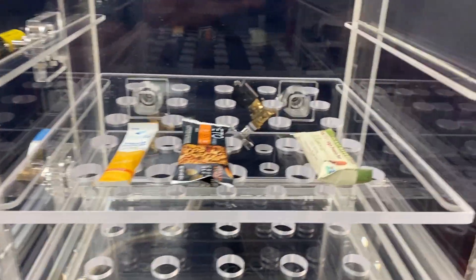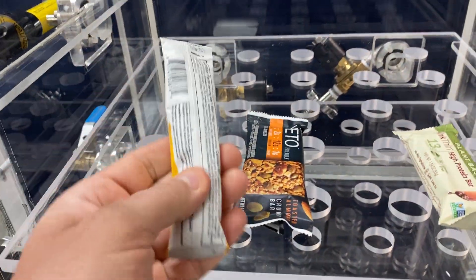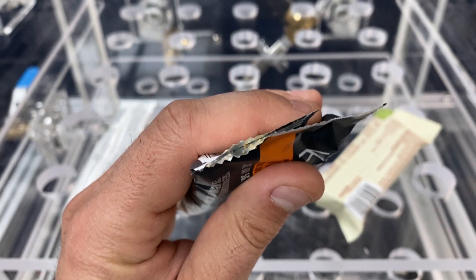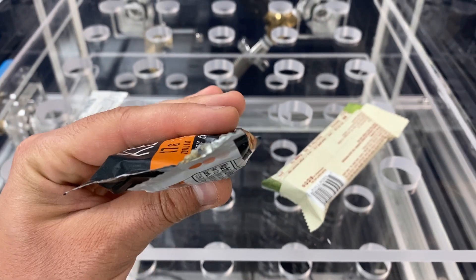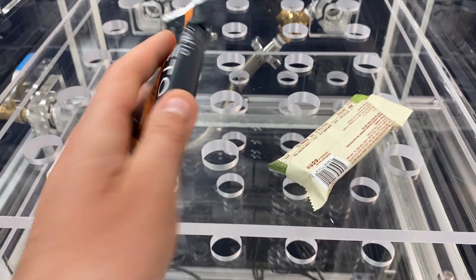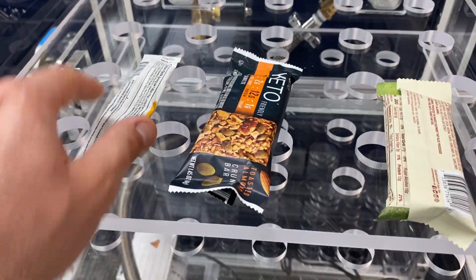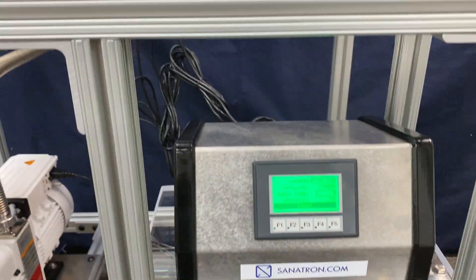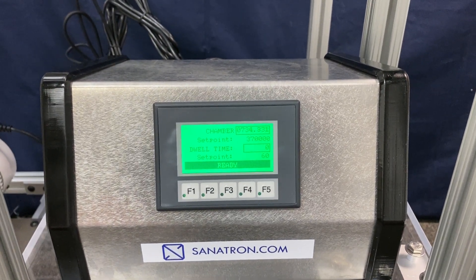Once it reaches ambient levels we'll be able to open the door. Now we inspect the specimens. It looks like this seal held up pretty well. As for the Keto Bar — it looks like there's a broken seal here. That explains why it didn't expand: as we pulled the vacuum, the air expanded and broke the seal. The Liquid IV and Think Bar show no packaging damage. That's how you can quickly determine whether your specimen will hold up to an altitude equivalent of 20,000 feet above sea level.